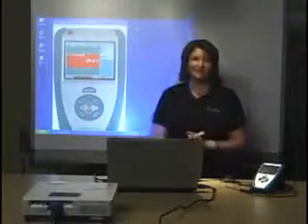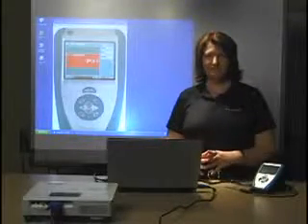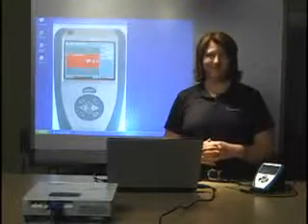So the emulator software is very nice to have. It actually is free. It comes with your LabQuest on the CD that ships, or you can download it free off of our website.